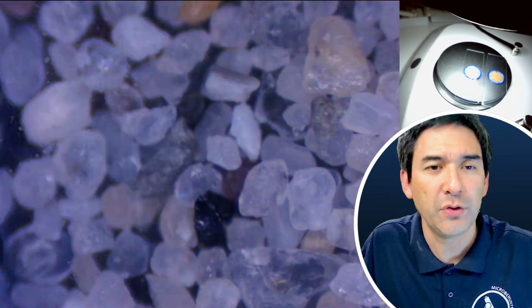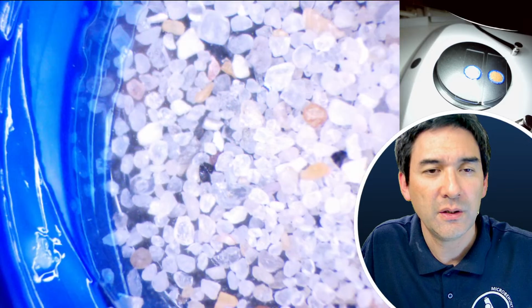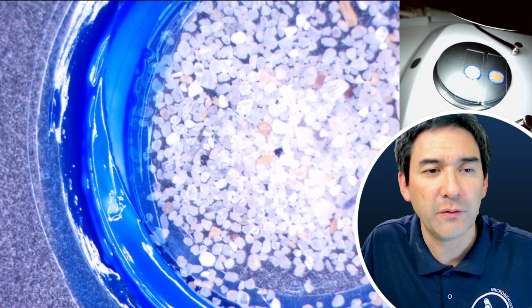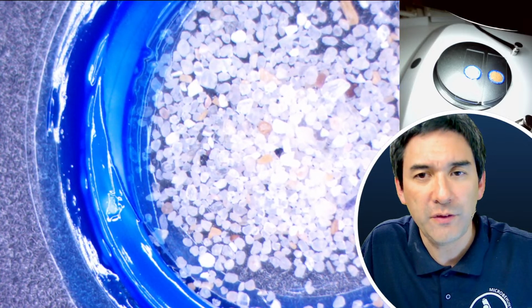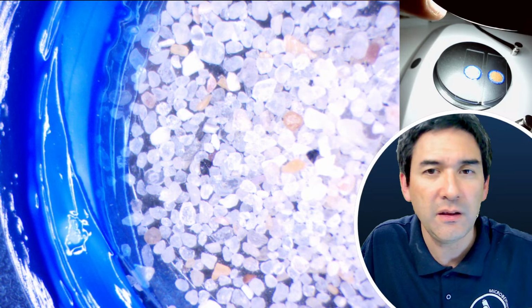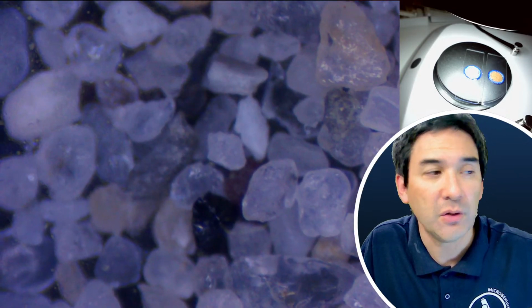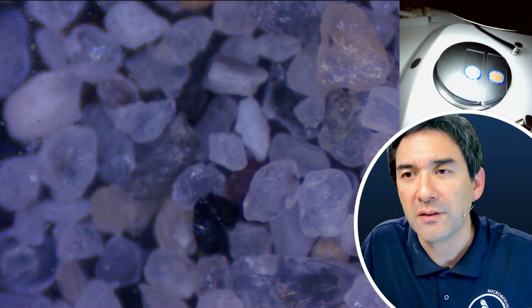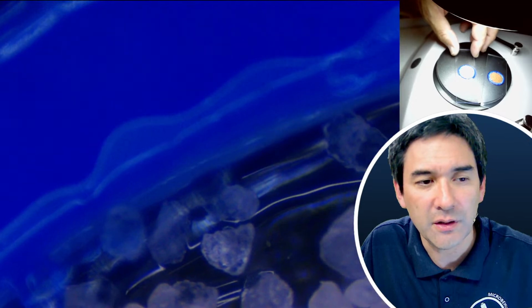You see, the further you zoom in, the darker it becomes, but I think it does do a little bit of auto exposure as well. If you watched one of my previous videos, I did now include also a Barlow lens beneath here. The Barlow lens reduces the magnification as well, because otherwise it would have been a little bit too big. But you know what? Let's have a look at this one under the other microscope.